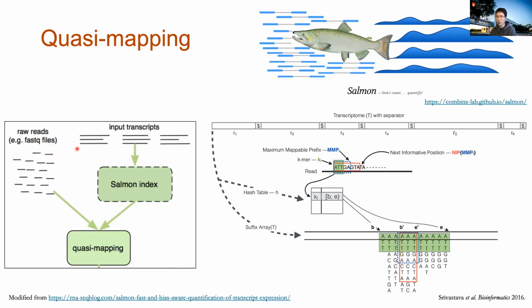to that transcript. So by doing so, we are not really aligning these reads back to the 3 billion bases to find where they locate. We are basically comparing the sequences and trying to associate the sequencing reads back to the transcripts they represent. The transcripts are small, much shorter than the entire genome, so the efficiency of Salmon can be very, very high. It basically compares our samples to the Salmon index and does the mapping. I'm not going too deep here. So that's the way Salmon works.